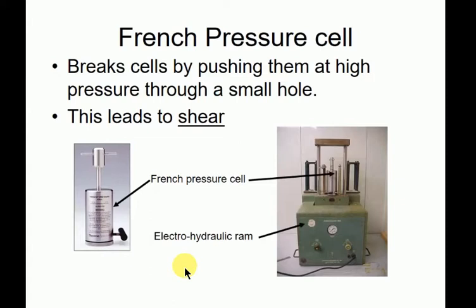And in the middle, there's a chamber, and into that chamber fits this T-bar that you can see here. On the end of that T-bar is a rubber seal, an O-ring, that allows it to seal off the top of the chamber. You can't see inside. So you plug the top with that T-bar, and on the bottom, you've got another T-bar that screws in. Depending on how hard you twist that, you can seal off the chamber at the bottom as well.